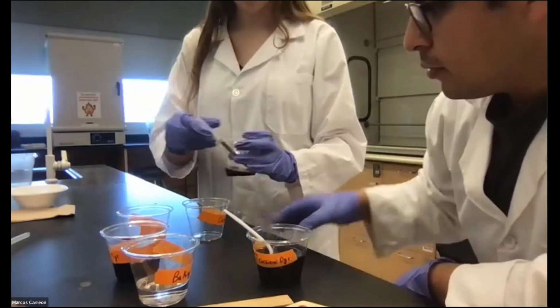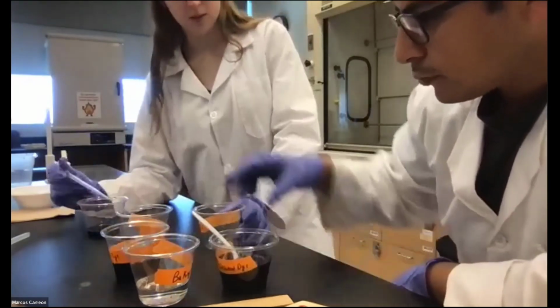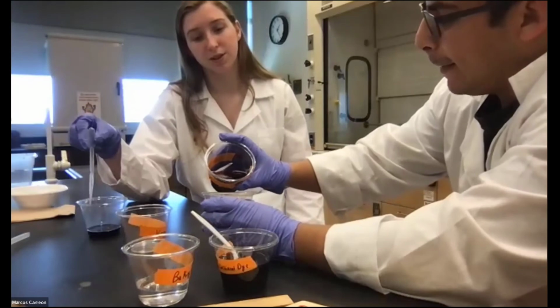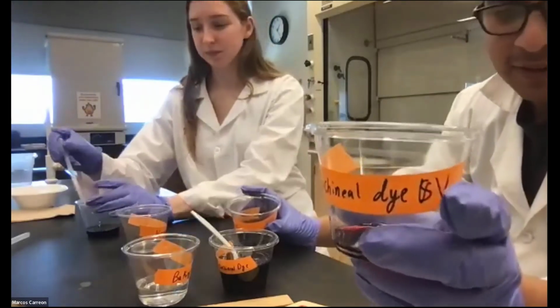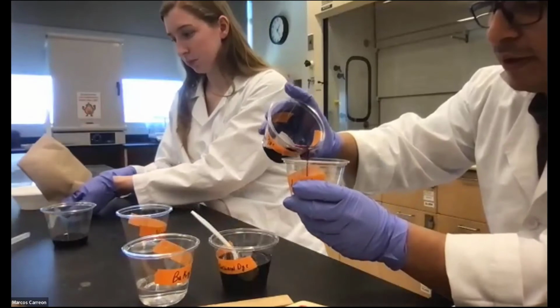Oh no, it's gonna be the same thing. If we pour it, then it won't have much of a change. So we're adding the cochineal dye right now to the one with the vinegar, or the vinegar is not in there, but we're prepping our sample here.